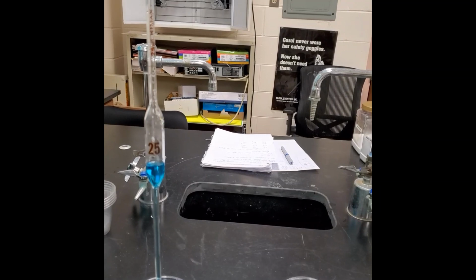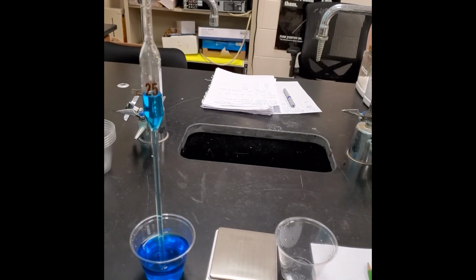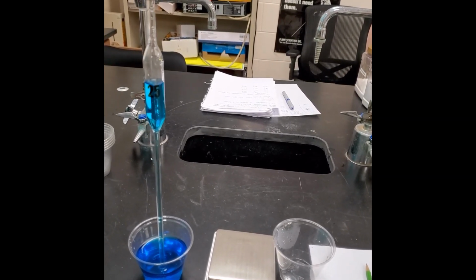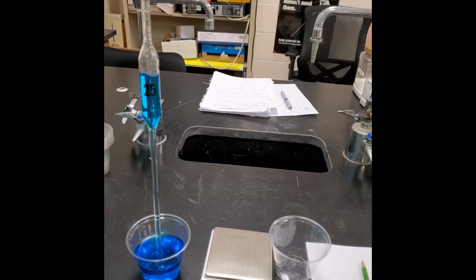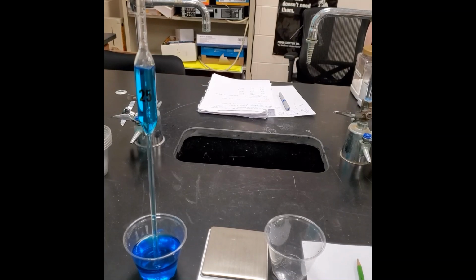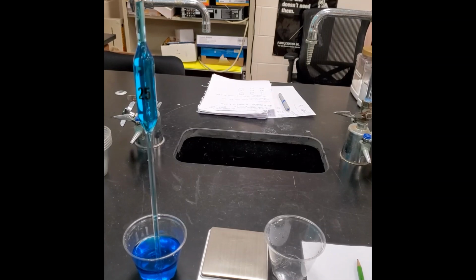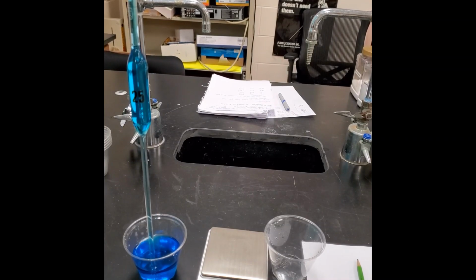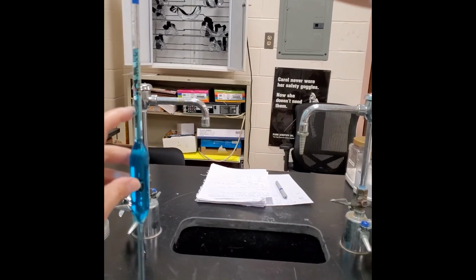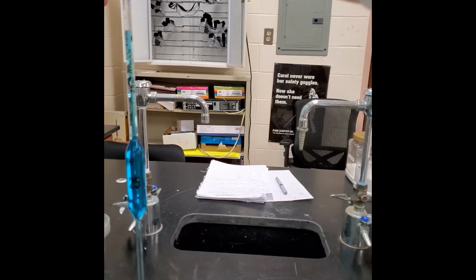Now this filler is designed for a 25 ml pipette. So you should be able to fill this with one application of the filler on the tip of the pipette, and the liquid starts to come up. Now, these are meant to have a good seal so that you can really dial in the volume, but it doesn't really get a good seal. So what's going to happen is you are going to allow the liquid to come up above the line. The line is right here, okay? Never have the liquid go up above into the filler.